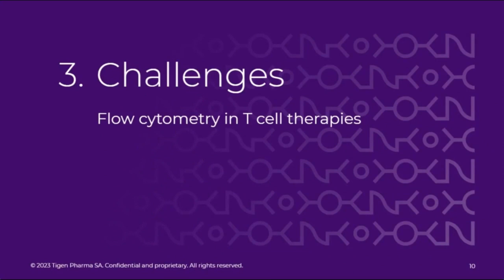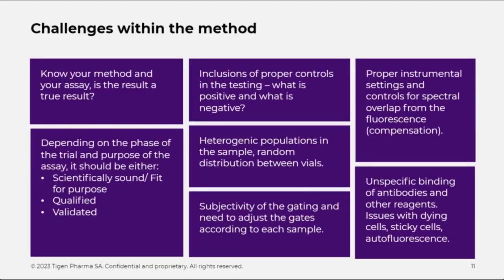What are the challenges? This is, I would say, a limited list of many common challenges. And of course, it differs from product to product depending on what you do. But the first one is you need to know your method and your assay. And you need to know, is the result really a true result? In order to know this, you need to look into specific parameters and assess your assay.